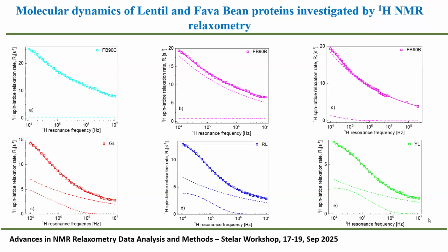Yeah, actually, these are things which become a little bit easier to understand with practice. But increasing scans is important when you have a sample which is not producing a good signal, to improve the signal to noise ratio. In that case, scans are important, and we suggest to our users to do at least 4 scans with proper phase cycling, so that you can have a good signal to noise ratio. I know for some samples maybe it's not possible, but this is something we suggest to all users: do at least 4 scans.